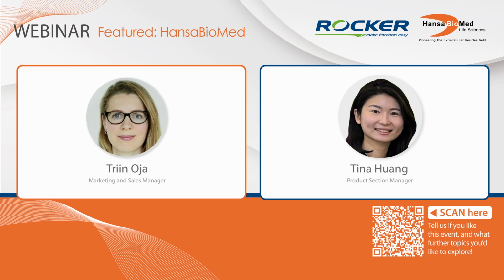recovery. Okay. Yes. And in your presentation, you mentioned that the old gold standard, ultracentrifugation, processes the sample in non-sterile conditions, and TFF can do it in sterile conditions, and it is washable and reusable. So yes, people are curious about how to ensure the sterility of the cartridge when reusing it.